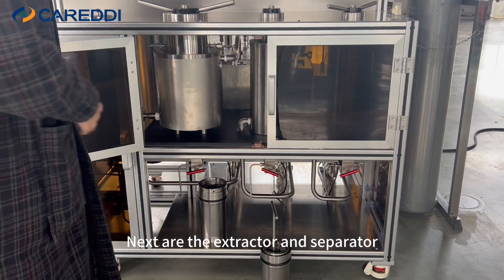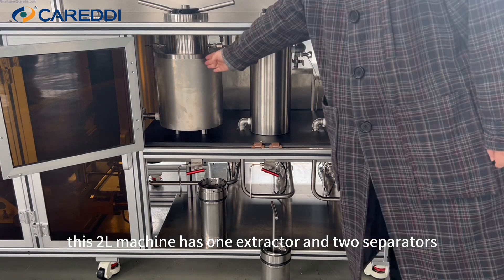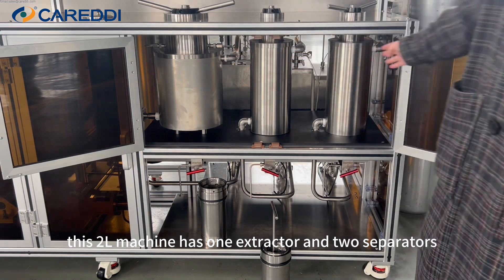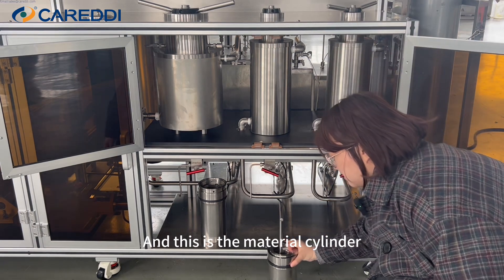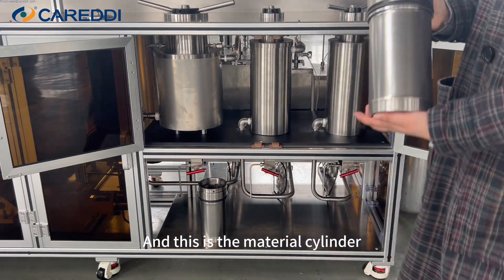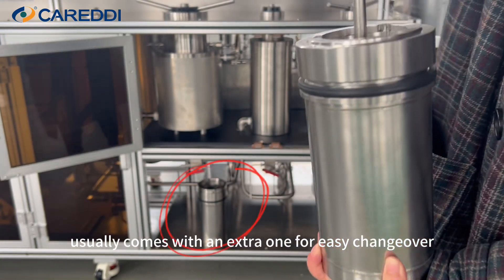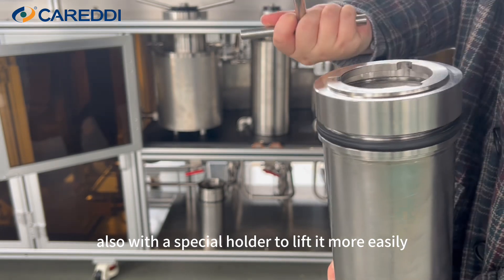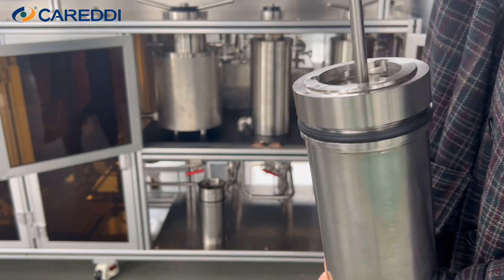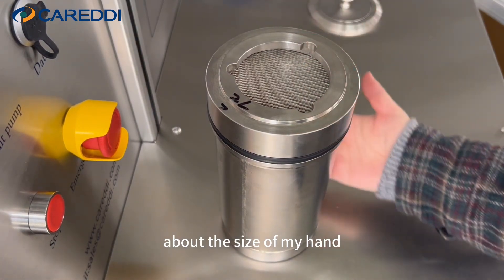Next are the extractor and separator. The 2-liter machine has one extractor and two separators. And this is the material cylinder, all made of stainless steel. It usually comes with an extra one for easy changeover, also with a special holder to lift it more easily. This capacity is 2-liter, about the size of my hand.